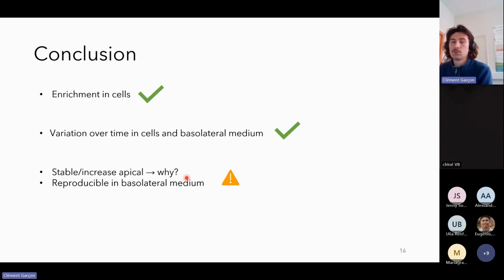That's something we need to be careful about, because probably sometimes the cell layer is very sensitive, and if it's slightly damaged, then that changes all the results we have. And so as I was saying, we have more incorporation of carbon and nitrogen from glutamine in the cells over time than lysine. So interesting results, and we need to investigate a bit more on why we see this.